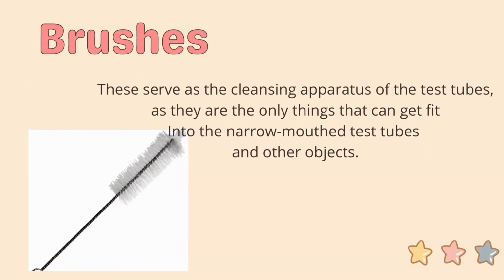Brushes. Not many people know it, but cleaning things are one of the biggest portions of everyday laboratory life. Brushes serve as the cleansing apparatus of the test tubes, as they are the only things that can fit into the narrow-mouthed test tubes and other objects.